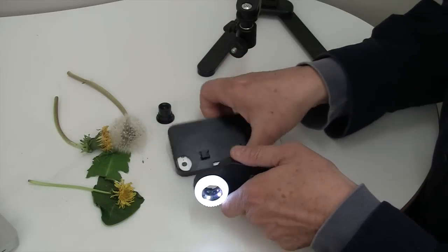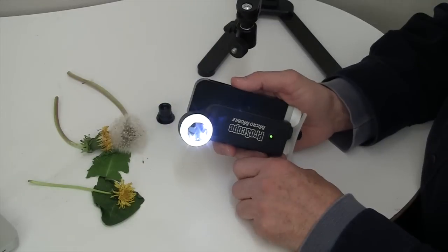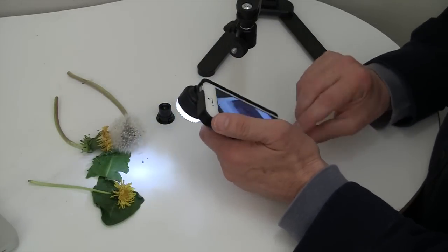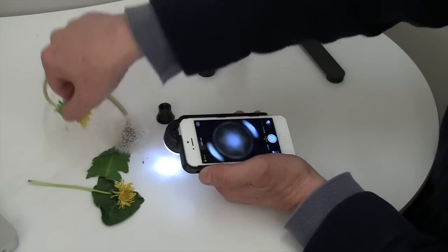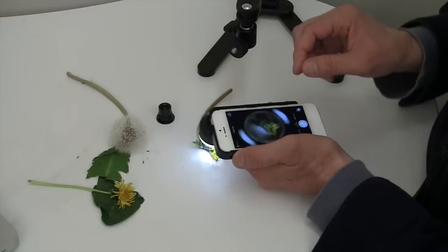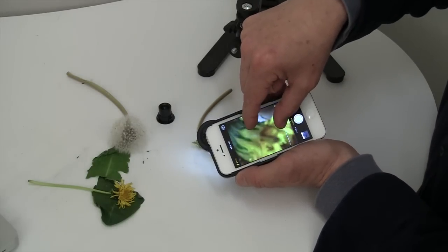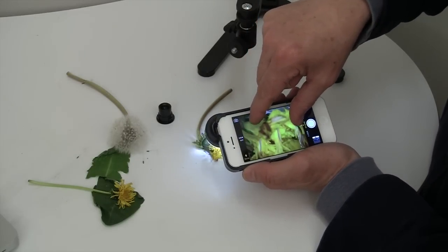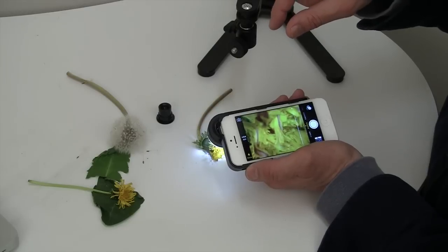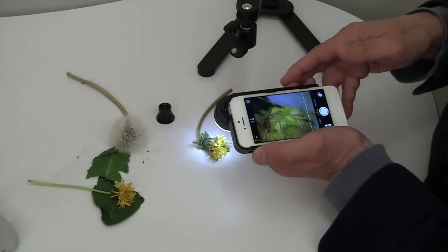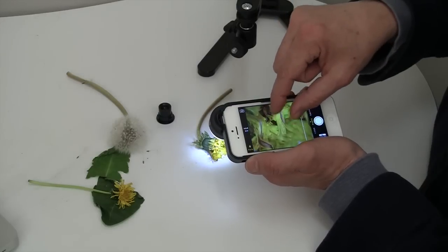Now at this point, I'd be using the white LEDs with the Apple camera. And then, all I have to do is, if I wanted to look at that dandelion at a distance, just like that, because what I'm doing is I'm providing direct illumination and just using the Apple camera.